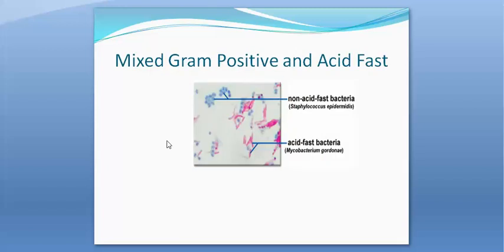Here we have a mixed slide with gram-positive, non-acid-fast bacteria in gram-positive clusters, probable staph. Here they say Staphylococcus epidermidis.